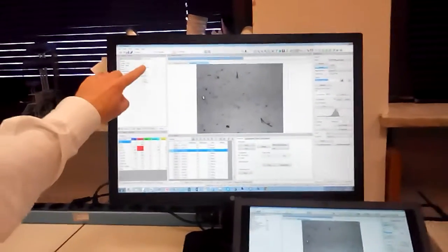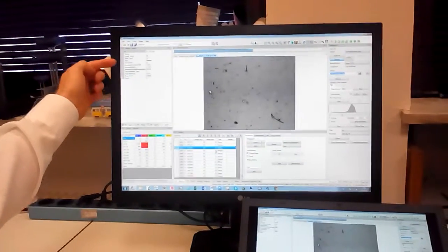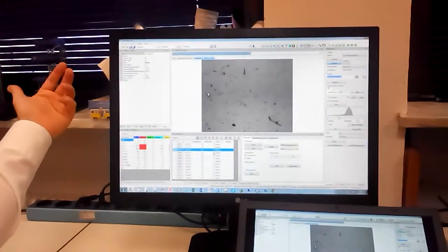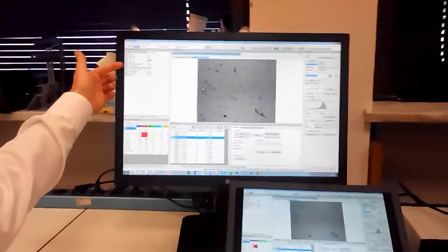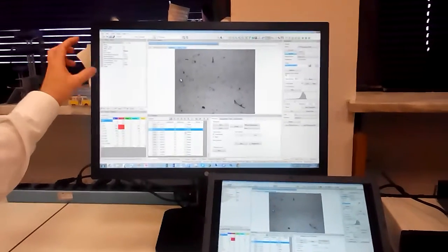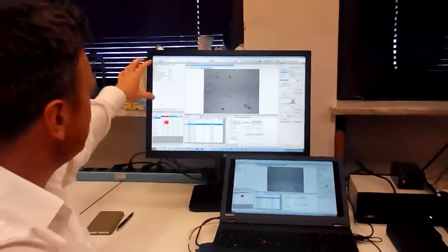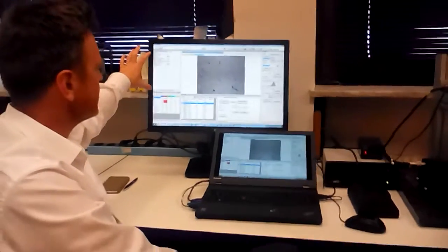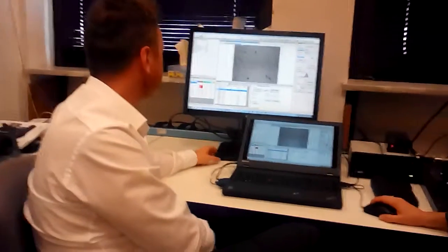This is telling us that the length is 36 microns, the width is 14 microns. It's classified as an other, i.e. it's not a metal, it's not a fiber, so it's just classified as a general particle. Then there's the area in pixels that it takes up, and we can actually modify this as well. You can put whatever you like in there. There's a drop-down menu. We won't confuse you with that, but you can have any number of things here. There are many features that are mentioned.